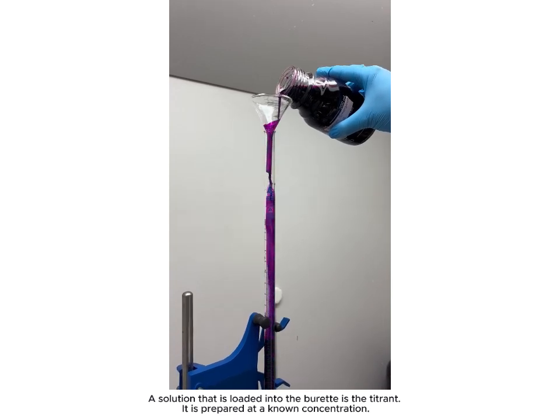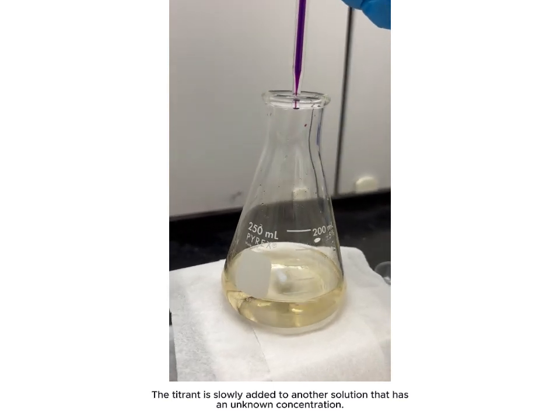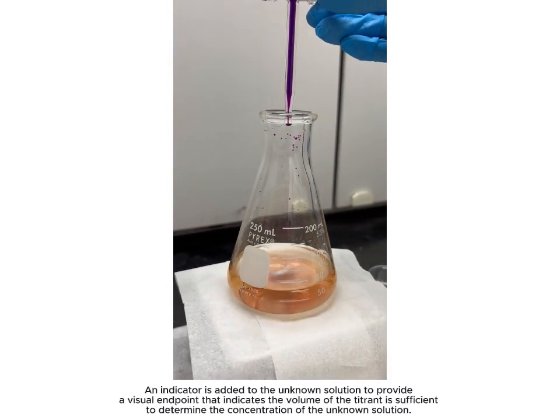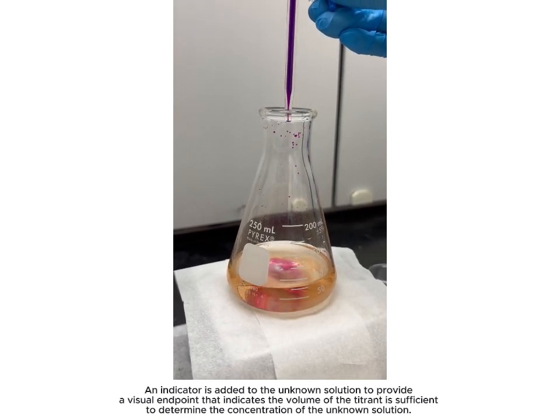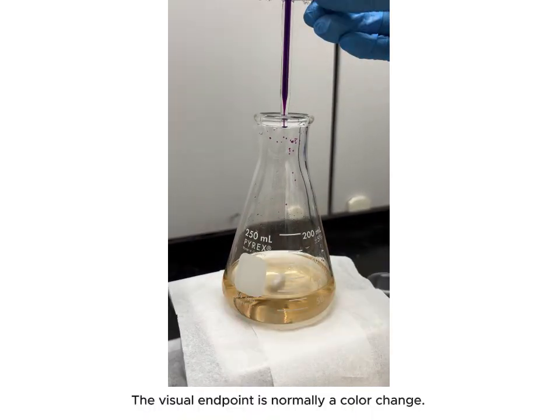It is prepared at a known concentration. The titrant is slowly added to another solution that has an unknown concentration. An indicator is added to the unknown solution to provide a visual endpoint that indicates the volume of the titrant is sufficient to determine the concentration of the unknown solution. The visual endpoint is normally a color change.